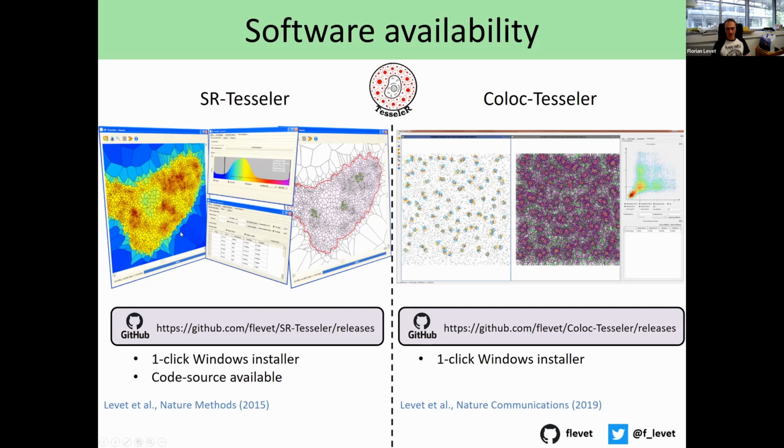I will explain later in the workshop what SR Tesseler is and what it is doing. The same for Colloc Tesseler. And in 2019, I also released Colloc Tesseler for colocalization analysis of single molecule localization microscopy data. Again, you can find it on my GitHub. In this case, there is no source code because I didn't have the time to really clean it.